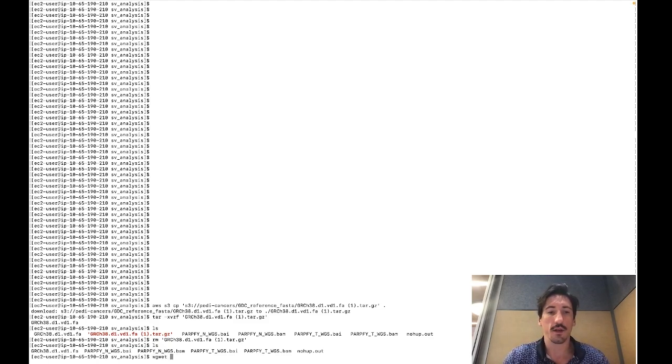So the first thing we need to do is pull the repo from Anaconda's website. This is a pretty common package manager that bioinformaticians use. There are tons of different packages included in miniconda that are not just for this particular analysis.